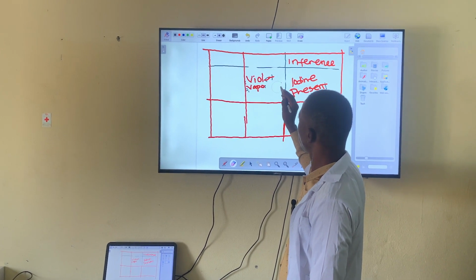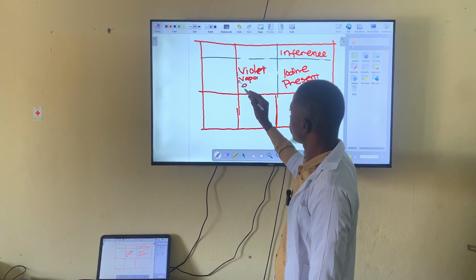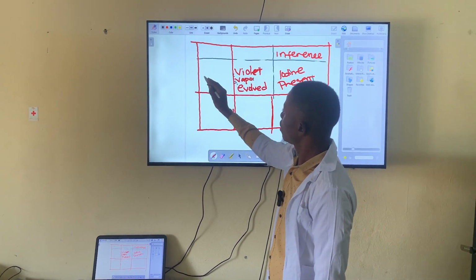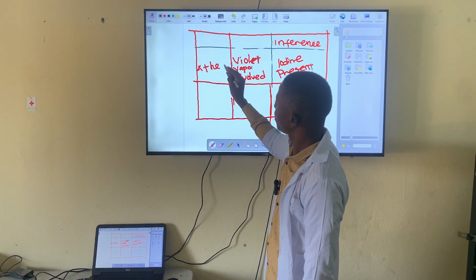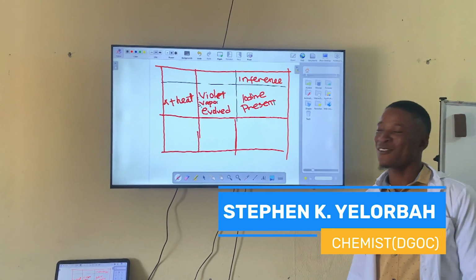No need to put was. Violet vapor evolved. So here, with A plus heat, I think you have gotten your answer.